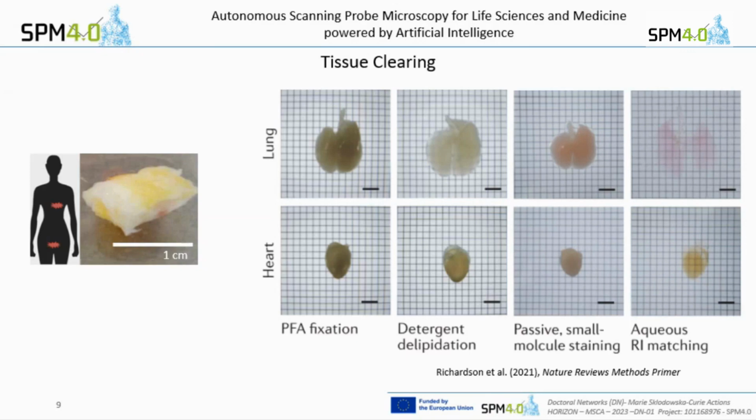refractive index matching. And this is also something I wanted to talk about really quickly, because you might know from some optics lecture that the resolution of a microscope also depends on the numerical aperture, which basically gives you information of how much light an objective can capture. And this is dependent on the opening angle of the objective, which is limited in most cases, and the refractive index of your system. And this is something you can also tune a little bit.